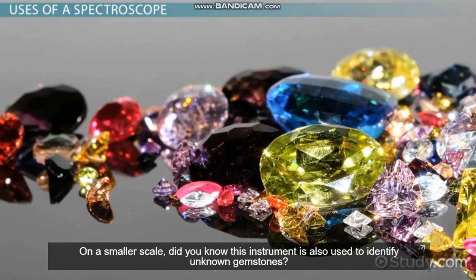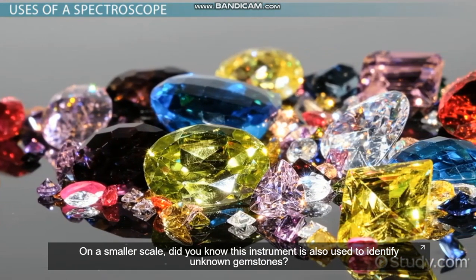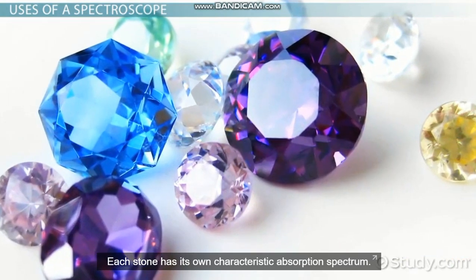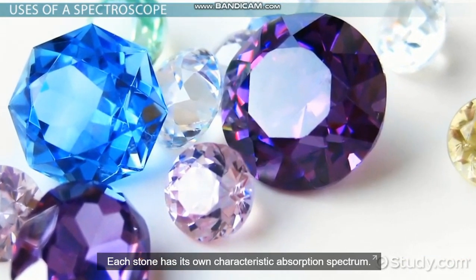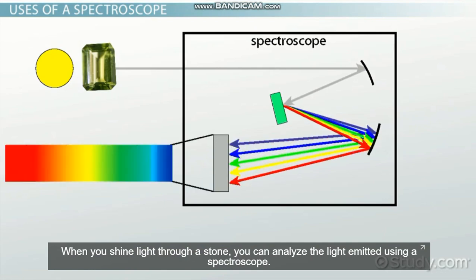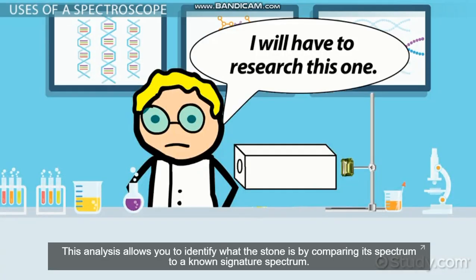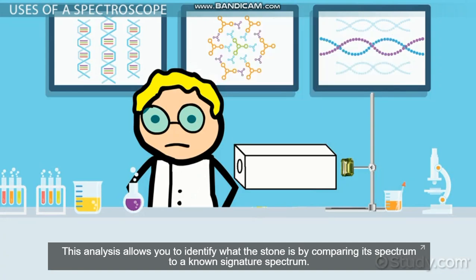On a smaller scale, did you know this instrument is also used to identify unknown gemstones? Each stone has its own characteristic absorption spectrum. When you shine light through a stone, you can analyze the light emitted using a spectroscope. This analysis allows you to identify what the stone is by comparing its spectrum to a known signature spectrum.